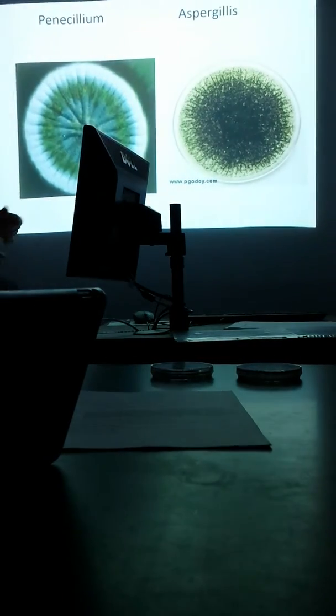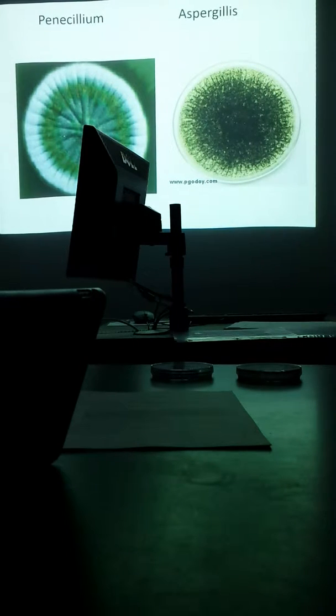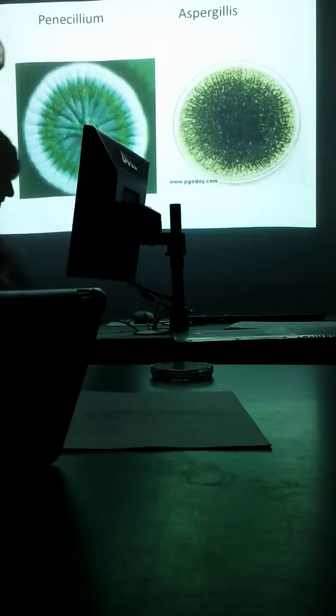We've got the Aspergillus plate. I won't show you the Penicillium. So again, I talked to you already about the two plates. Remember, Aspergillus has got the black-looking spores on mine here, and then the Rhizopus is real kind of light gray colored for the spore-producing structures. You can see that it's black on this one right here.